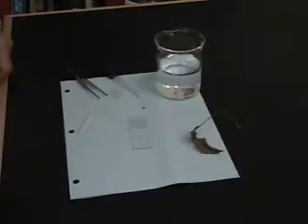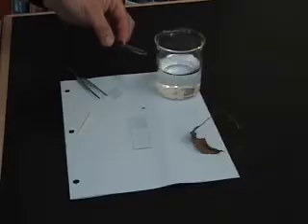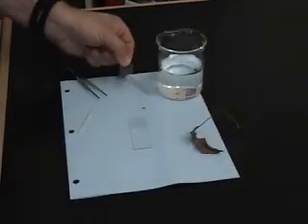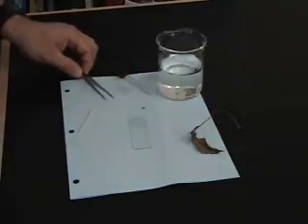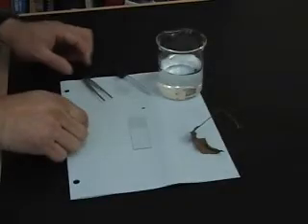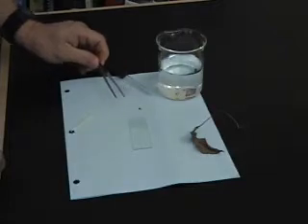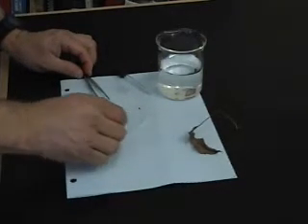To make a wet mount slide, you will need a few materials to help you. First, you will need a beaker of water. Then you will need an eyedropper, a cover slip, a pair of tweezers to hold your specimen, a toothpick as an aid, your specimen itself — in this case, we are using a small leaf — and finally, your slide.